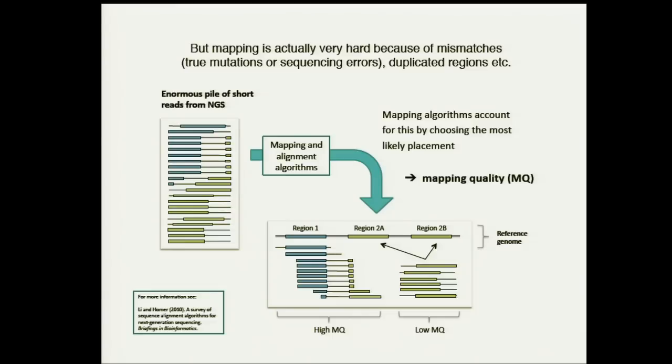There will be a one-number score for that particular mapping and alignment. BWA will also try, if the other placements are close enough to the one that you tried, the other ones and see if with a different alignment there, the score is higher. But in general, there will be only one place, and the alignment will just separate the mismatches and the indels as best as it can.